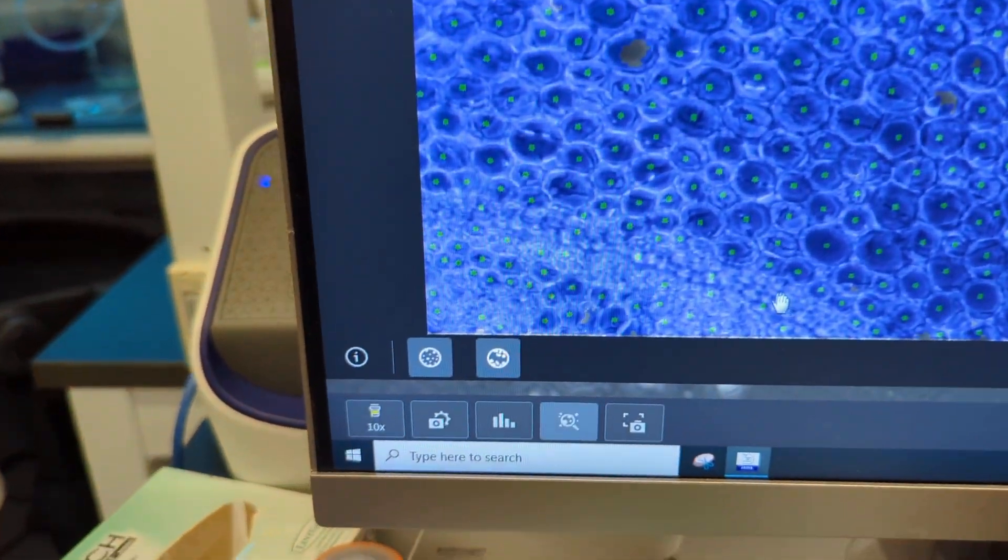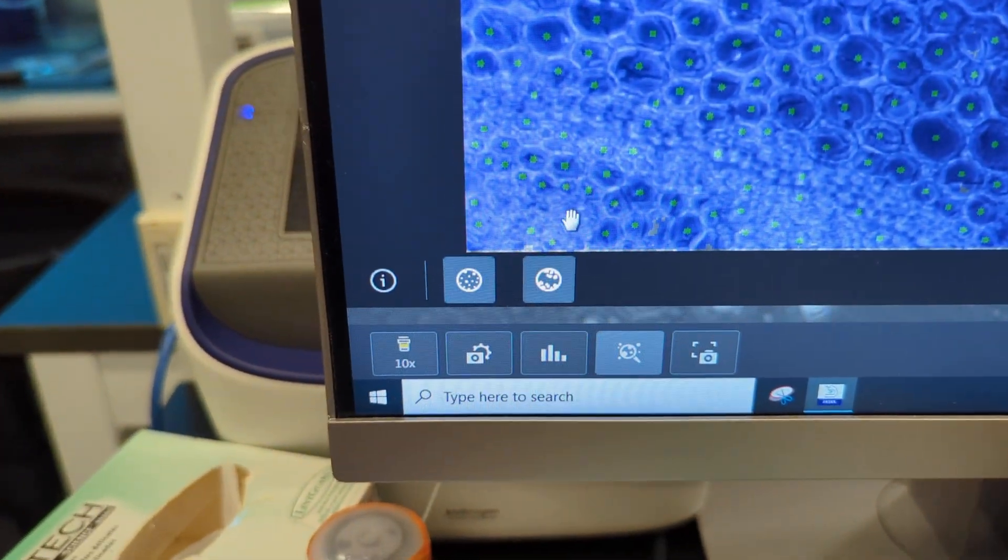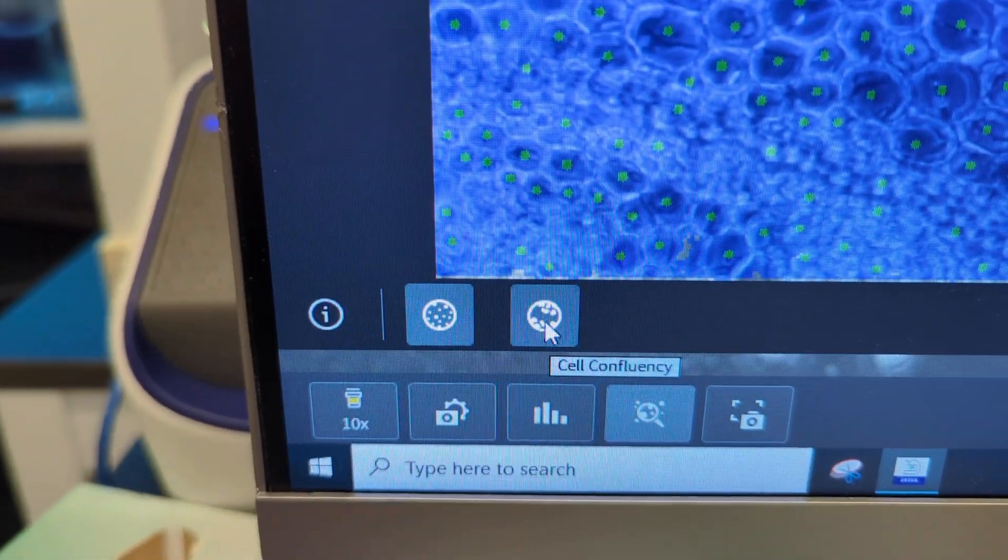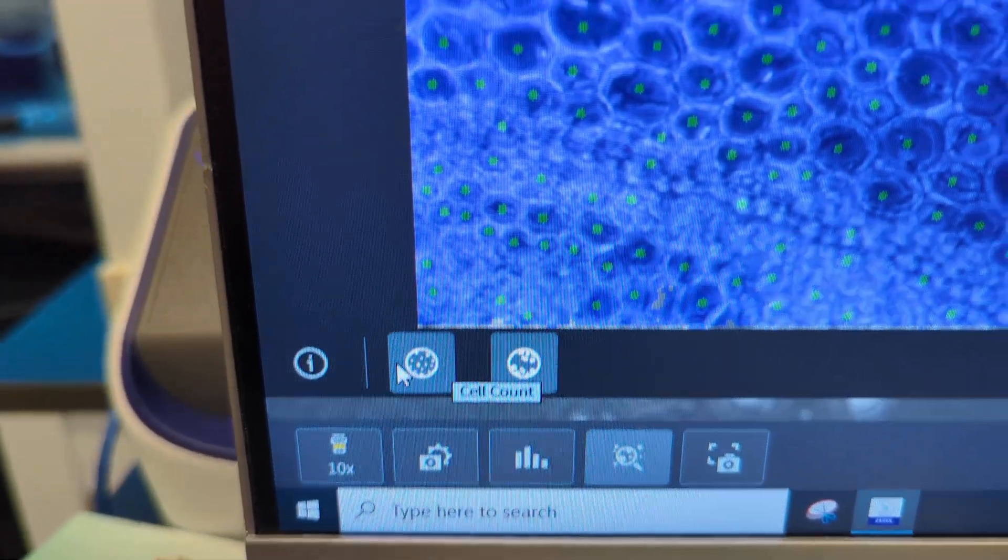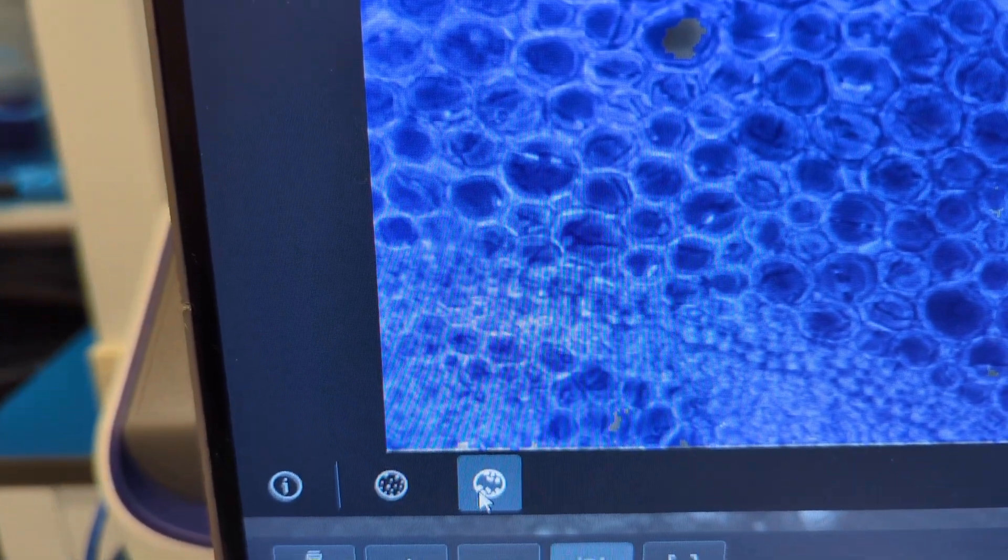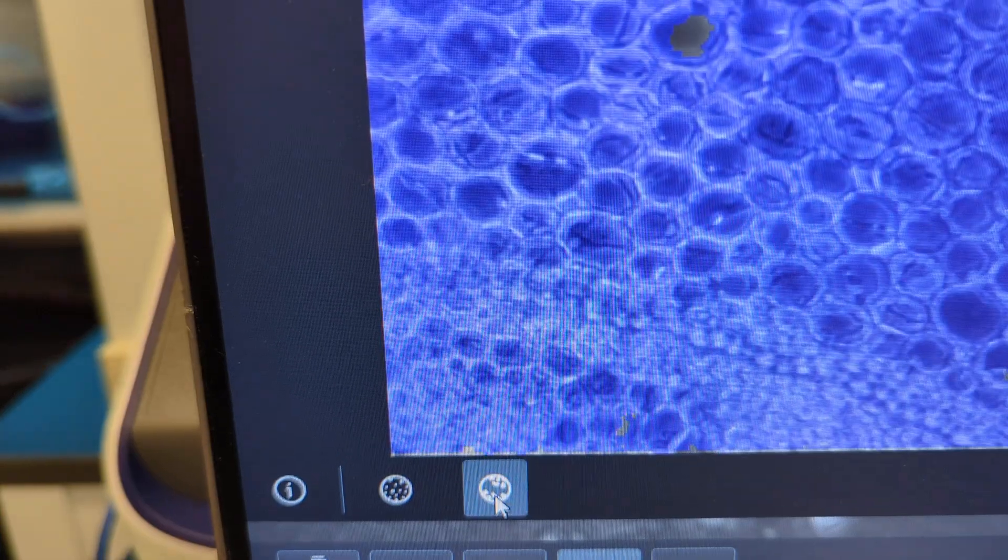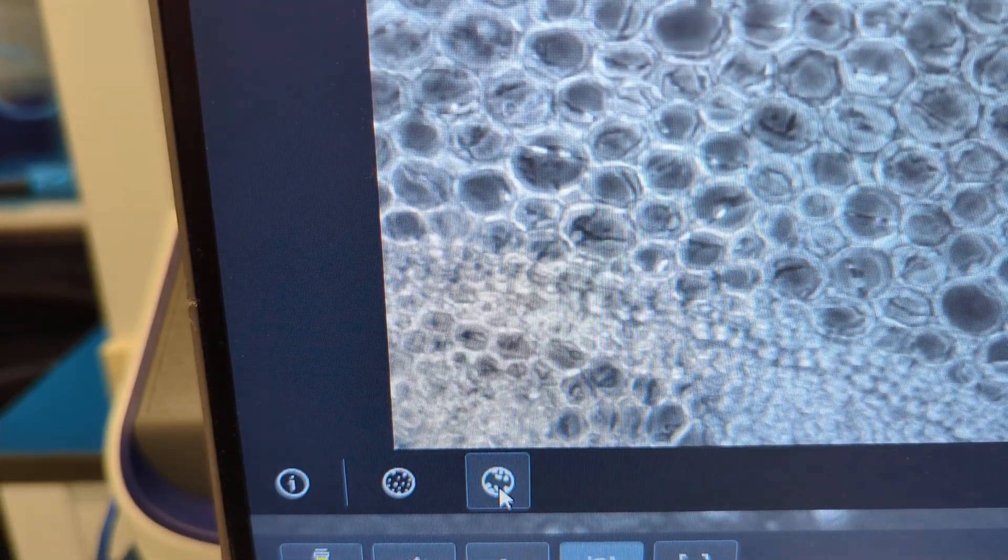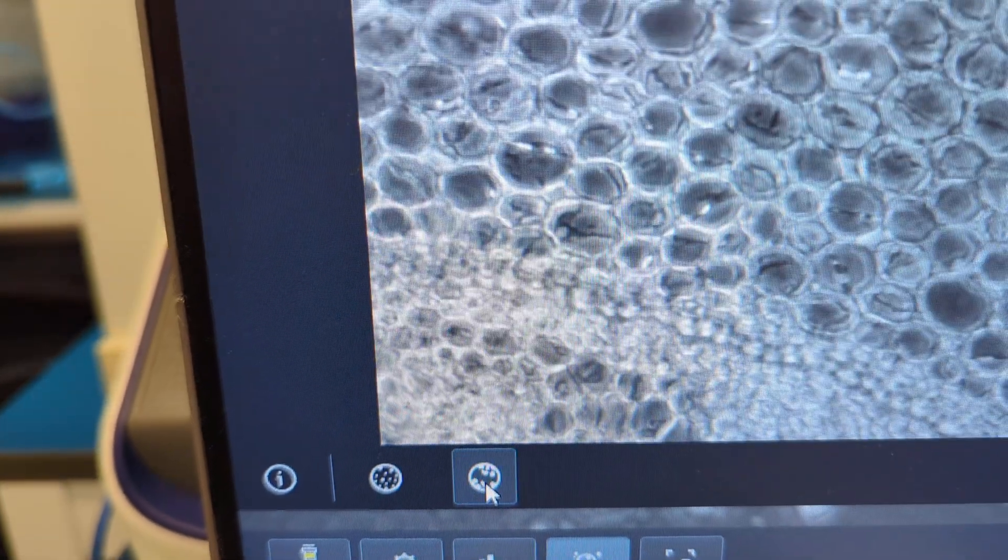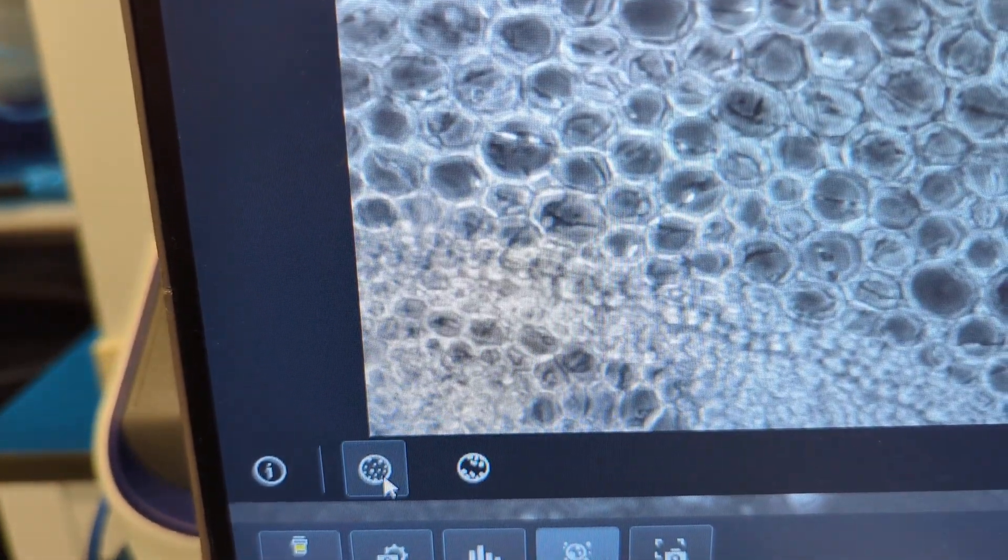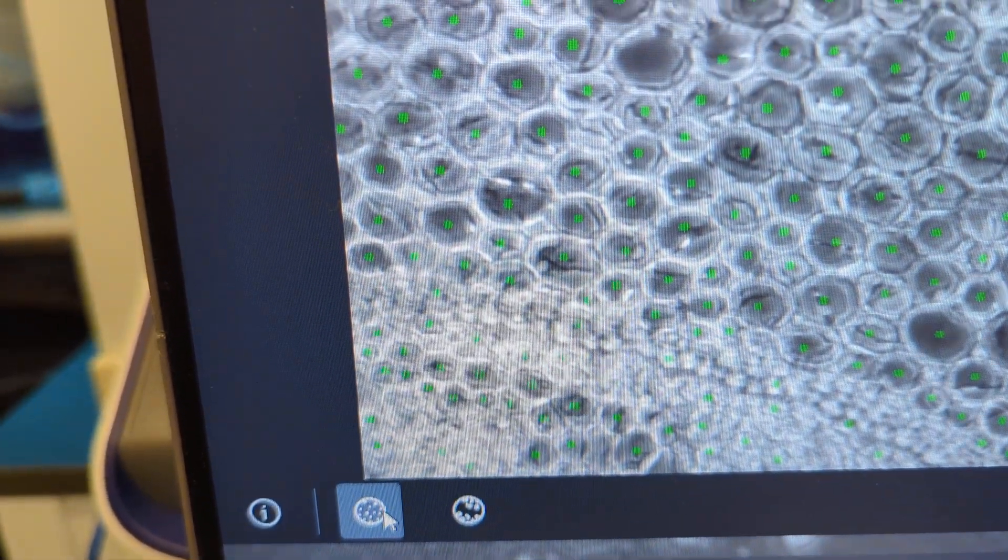Meanwhile, over on this side of the screen, you have the two count and confluency icons. So turn it on, off, on, off, confluency, turn it on, off, on, off, the counts, you see that? And you can have both on, of course.